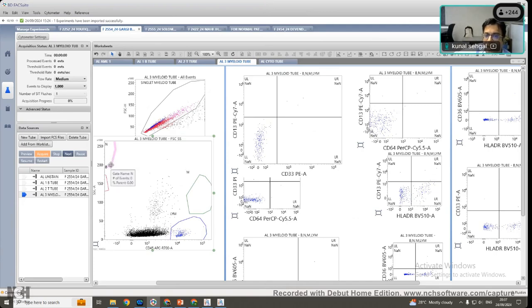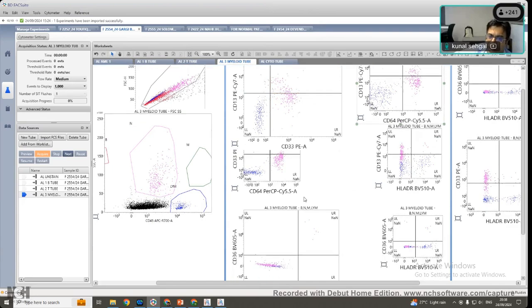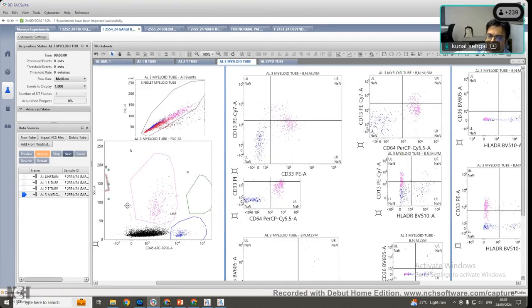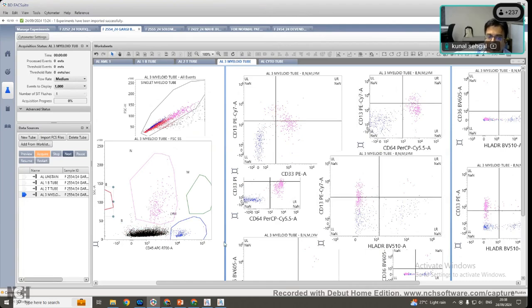What do you think neutrophils express? This should be gated, sir. If I get neutrophils, can you see internal control in CD33, CD13 now? Yes, sir. Neutrophils and myeloid cells are positive for CD13, CD33, positive for CD64. They are not immature, so they are negative for CD117, which is normally so. Now you know CD33 and CD13 are working. Then when you put the blast, you can confidently say, yes, my myeloid markers are absent, HLA-DR is present. Also to note, HLA-DR is present also on normal B lymphocytes.